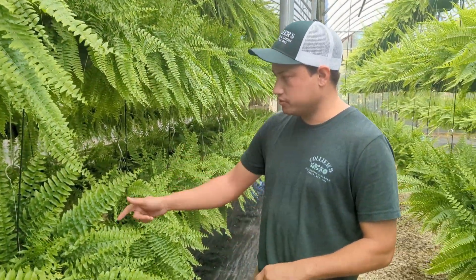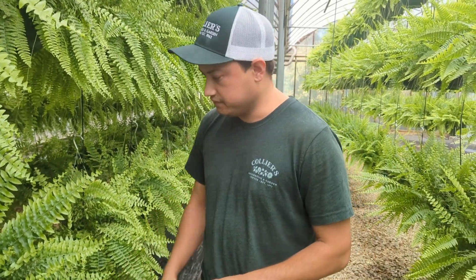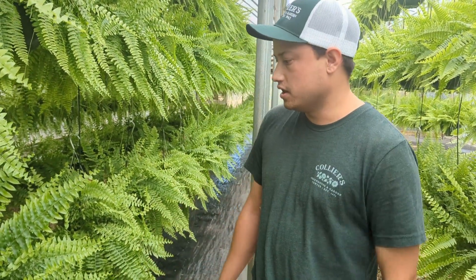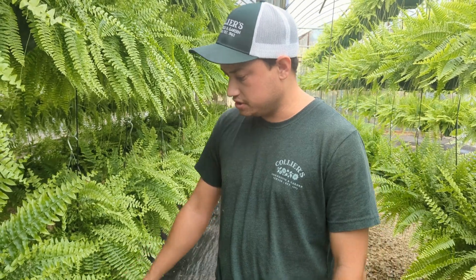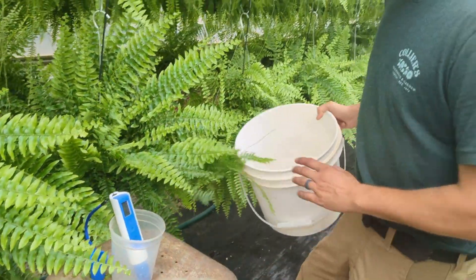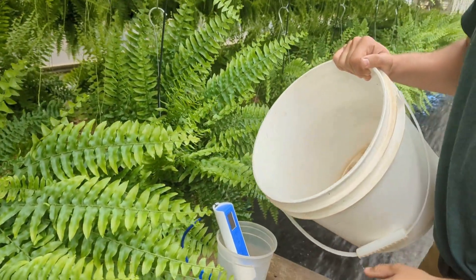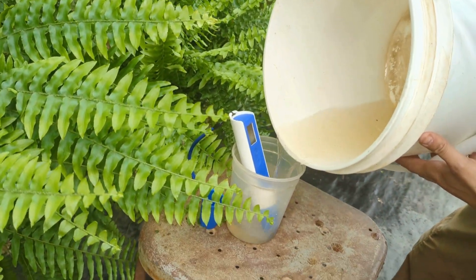When we're doing our pour-through method on our ferns, I like to always use a bucket underneath the ferns to catch the runoff. Even when they're dripping, you're still getting a good amount of water and real-time data on it. So we just grab our pour-through water — or drip-through water as I like to call it — and add it to a smaller jar.